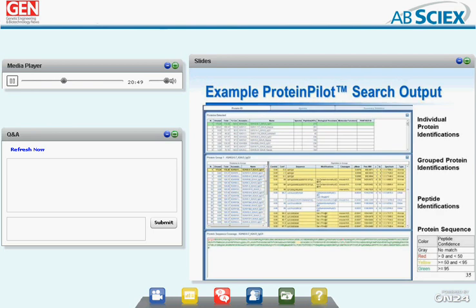So in a simple example of a ProteinPilot search output, it is divided into 4 main sections. The top section of the original output window shows your individual protein identifications, ranked based on the number of peptides identified at 95% or higher. If you move to the middle left side of the screen and click on any particular identification in the top window, it then shows all of the grouped protein identifications that match that sequence as well.